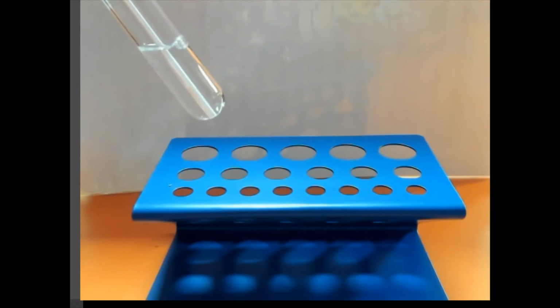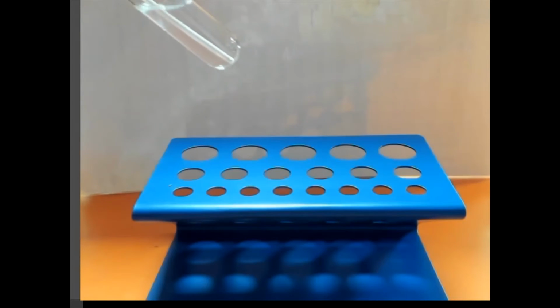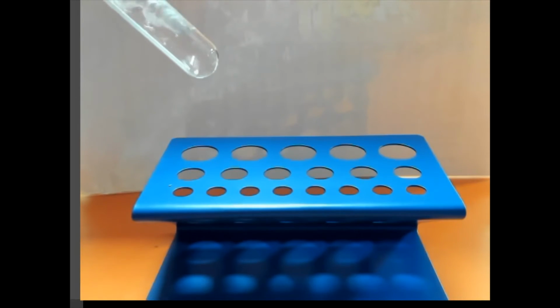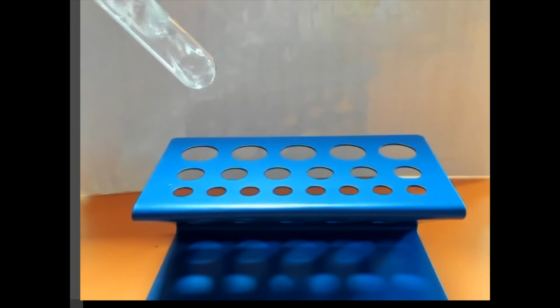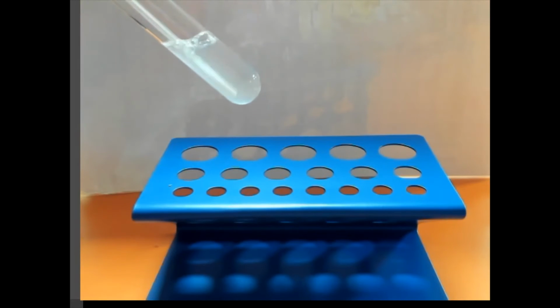It should change to cloudy after a while. It's still quite clear. It's getting a bit cloudy.